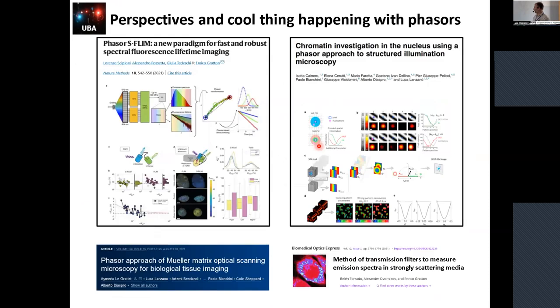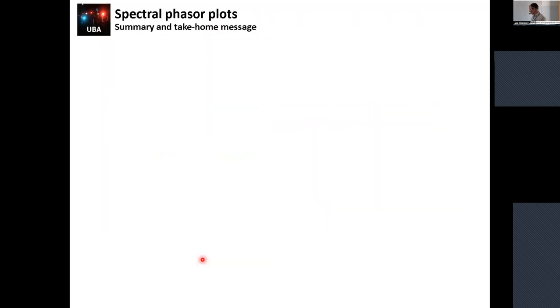So I don't have time to go there. I would like to highlight some new approaches using phasor. Enrico already mentioned Lorenzo's talk tomorrow on truly hyperspectral imaging. Luca Lanzano will talk tomorrow about how phasor will be useful for super resolution. Belen will talk about a new way to do phasor with up and down filters instead of sine cosine filters. And there are some other applications for different kinds of microscopy, but very useful for in vivo imaging. So thank you very much.